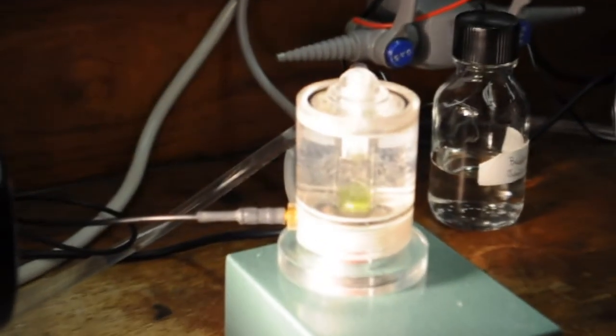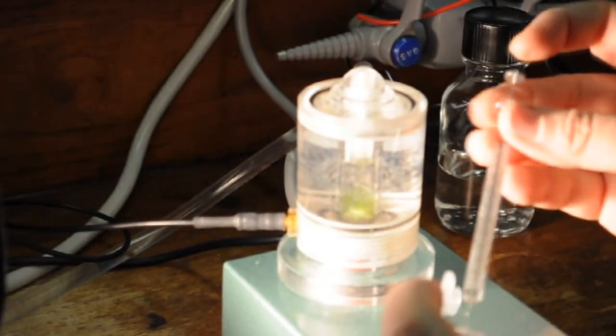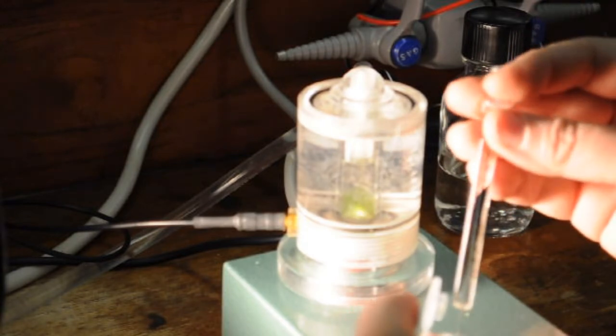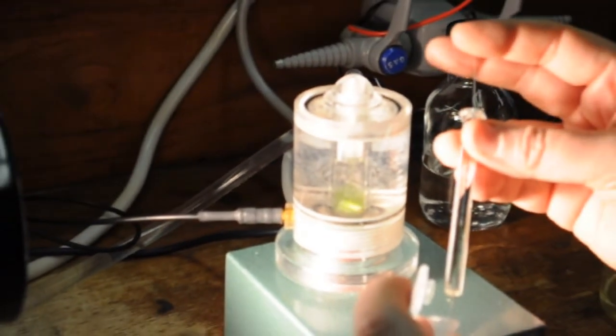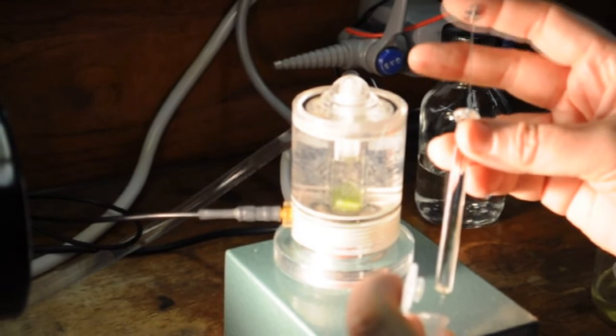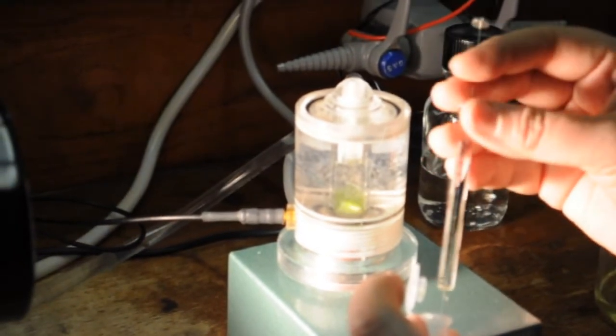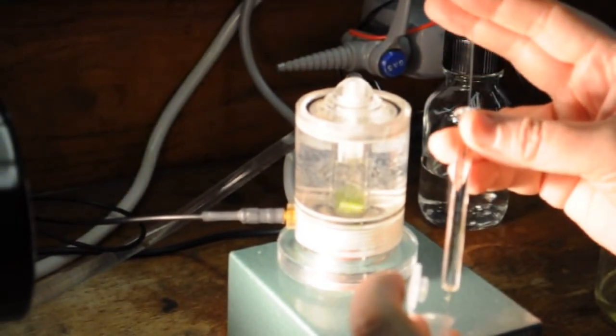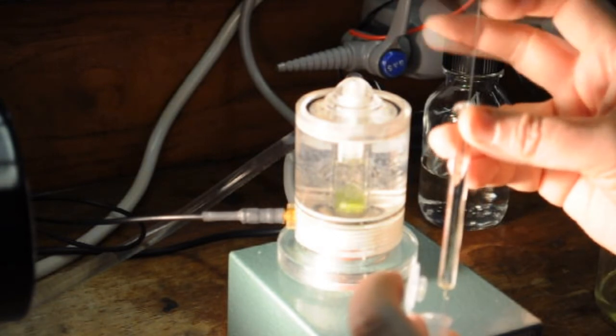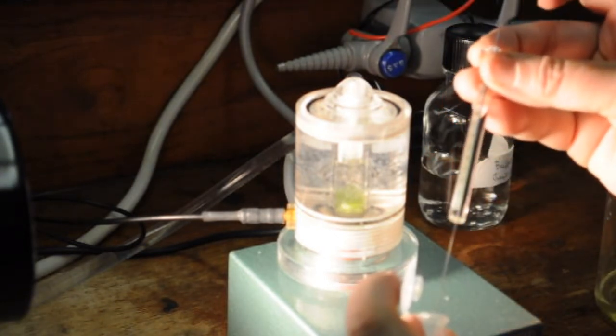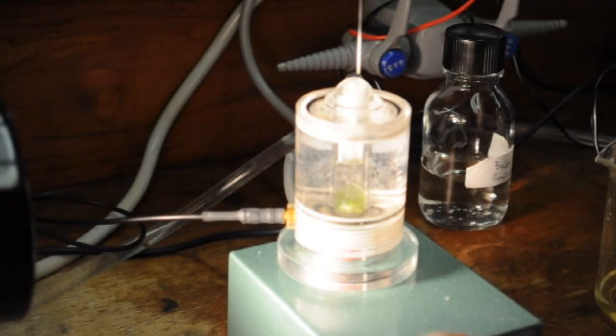For some experiments you will be adding a solution directly to the cuvette. To do this we use a Hamilton syringe and a volume of 5 to 10 microliters of the added solution. Rinse the syringe at least once with the solution you are going to add. Then draw up the required volume. Place the needle all the way into the cuvette plunger. Don't worry, the plunger is designed for this and you will not be able to damage the electrode.